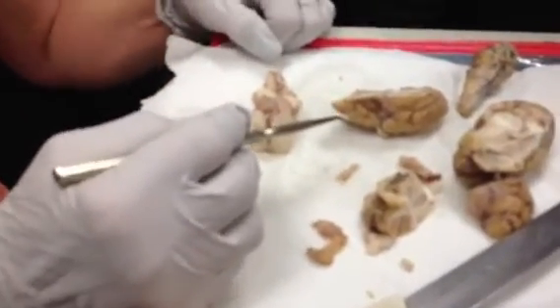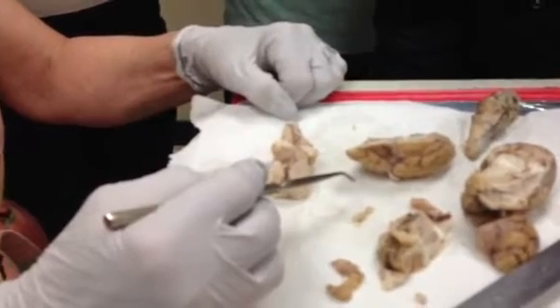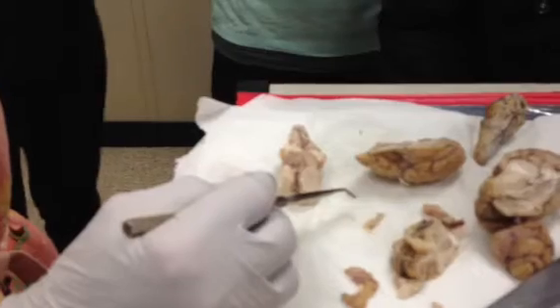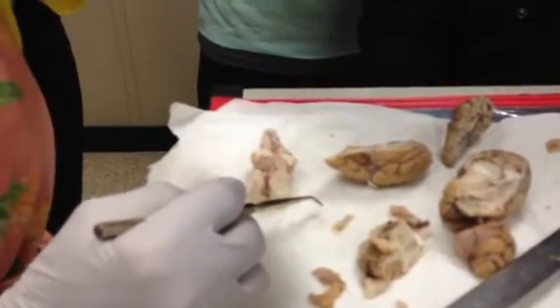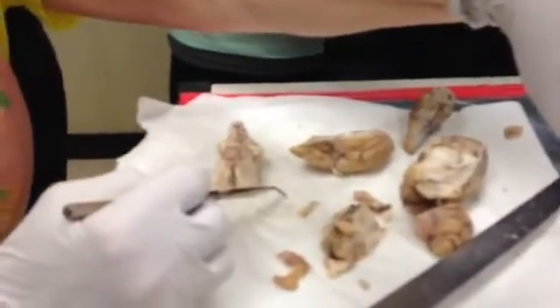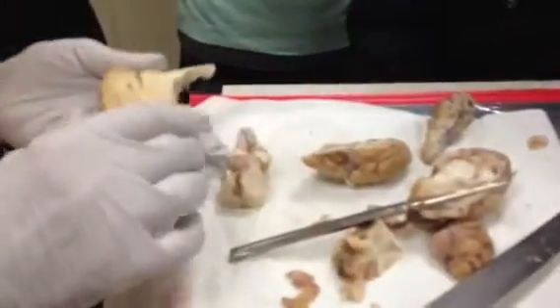Okay, somebody grab a sagittal section for me. Look on the table. Can you send it to me? Sagittal section. You want, I think, sagittal? There's one. This one? Yep. Is this it? Not sure.